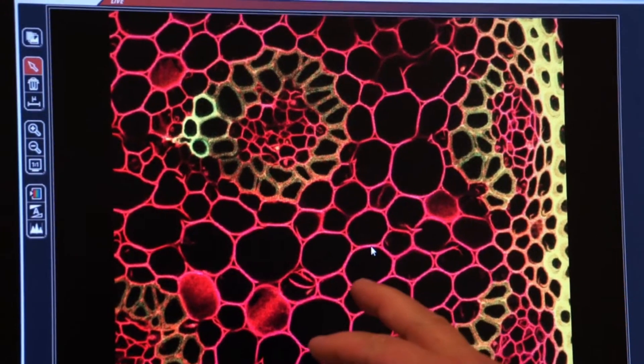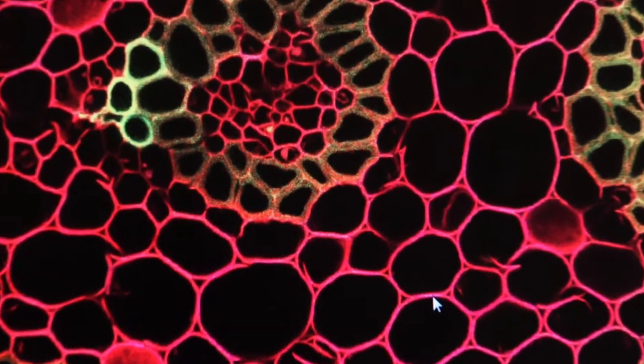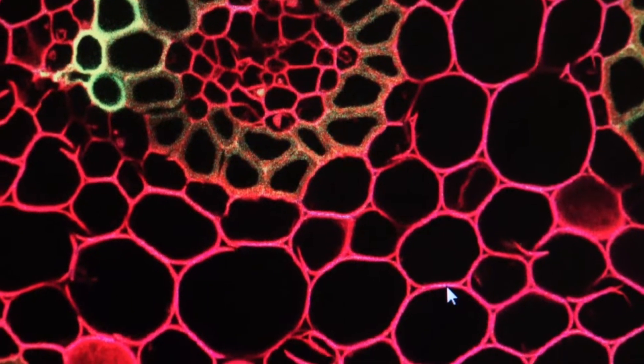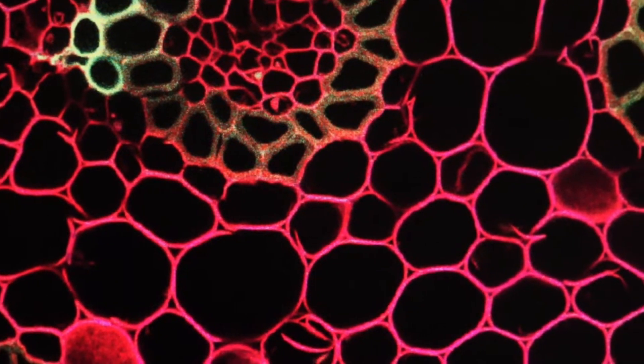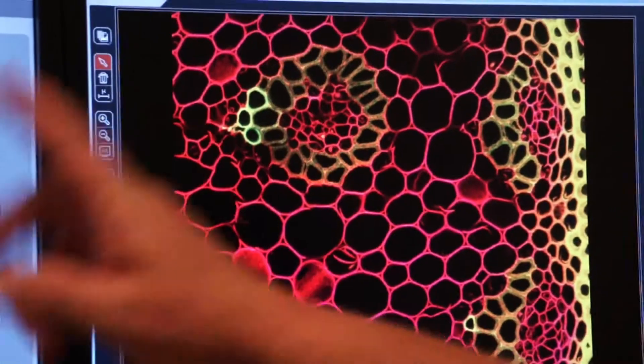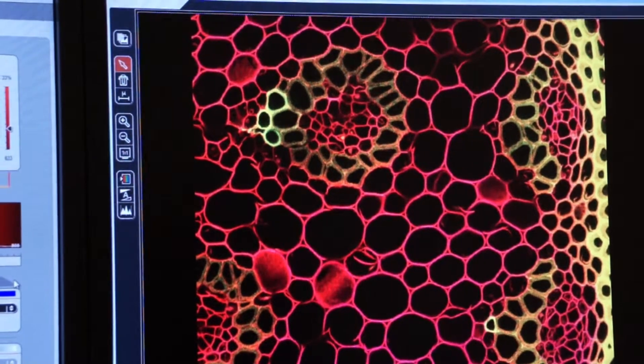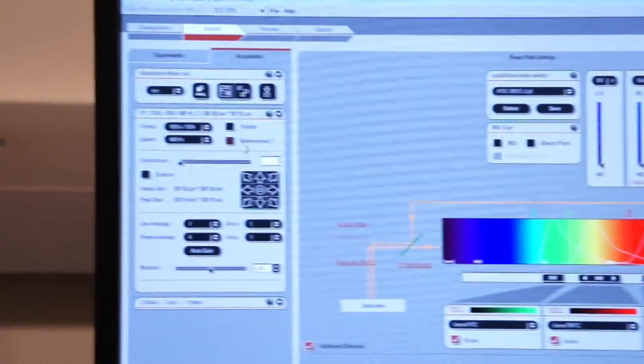So you can see that frame average is not as good as line averaging for producing a nice clean image. Let's try it again only this time we're going to increase our resolution even more. So I come up here to resolution.